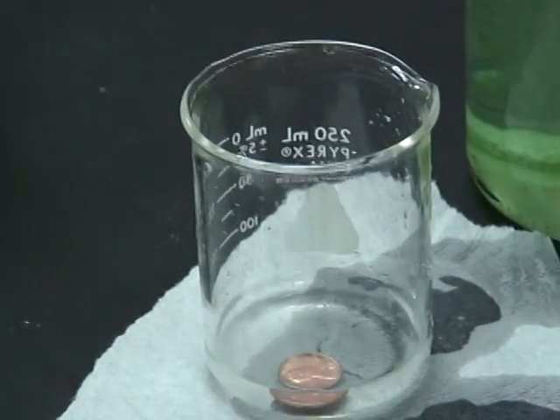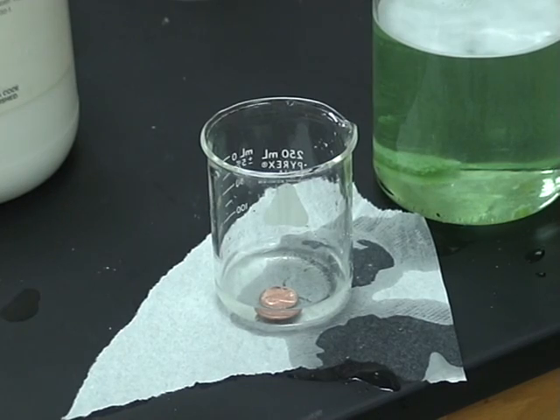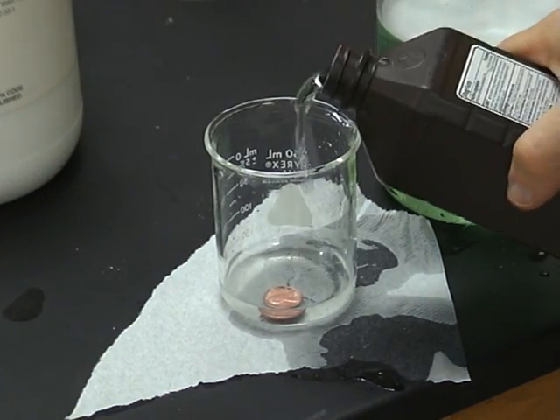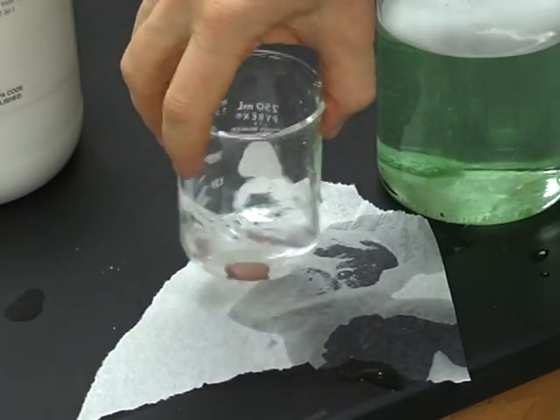We're going to take our penny one step farther. I'm going to add some hydrogen peroxide to it. Again, we'll swirl it around.